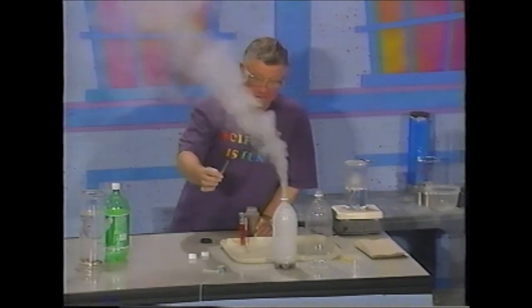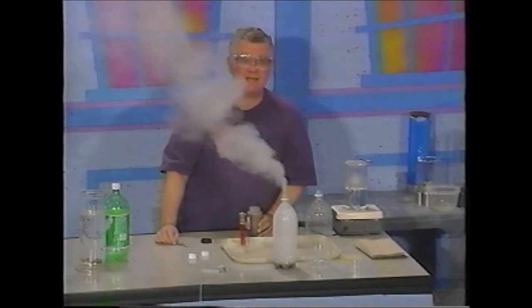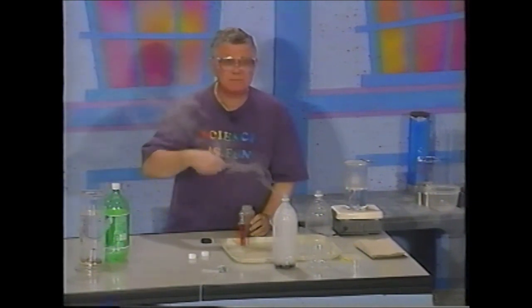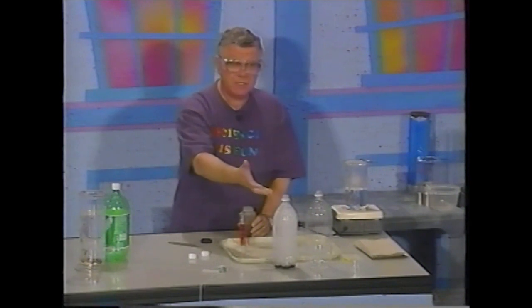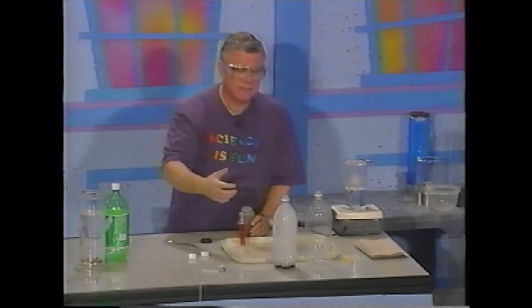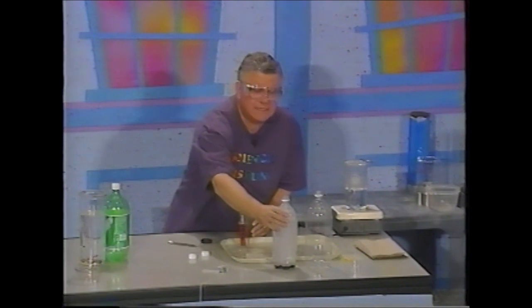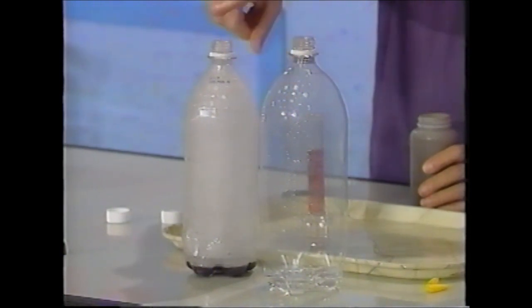It looks like a genie came out of the bottle, right? So this powder is called manganese dioxide. It's a solid that catalyzes, that speeds up the rate of decomposition, and we get water vapor. It comes out, and it's hot, so when it hits the air, it condenses. This reaction is one that releases energy in the form of heat, and you can see that something has happened to the size of this bottle compared to what it was before.